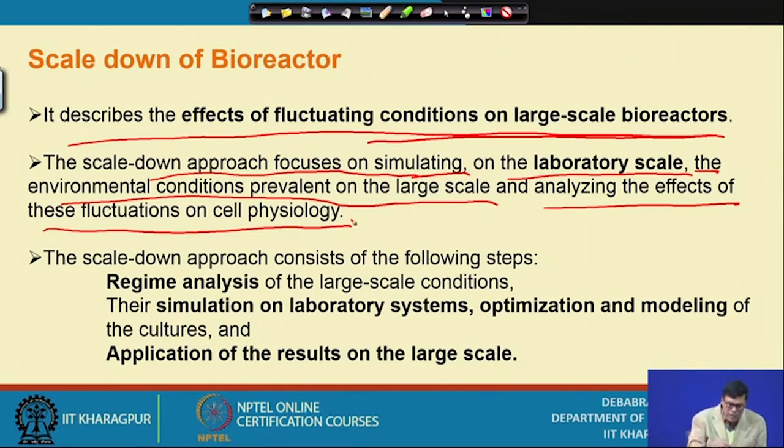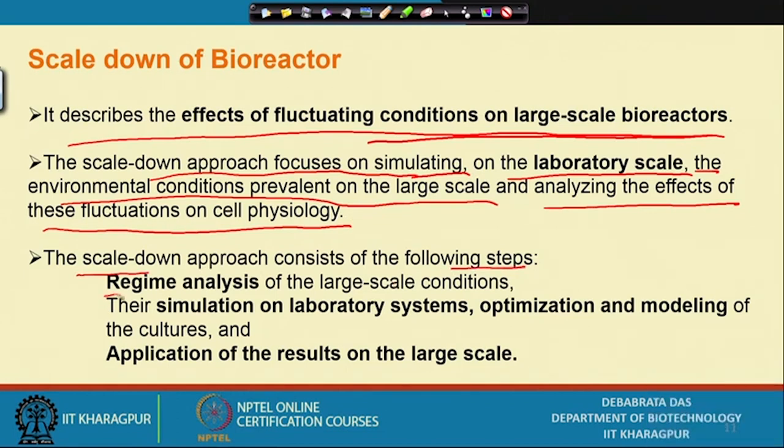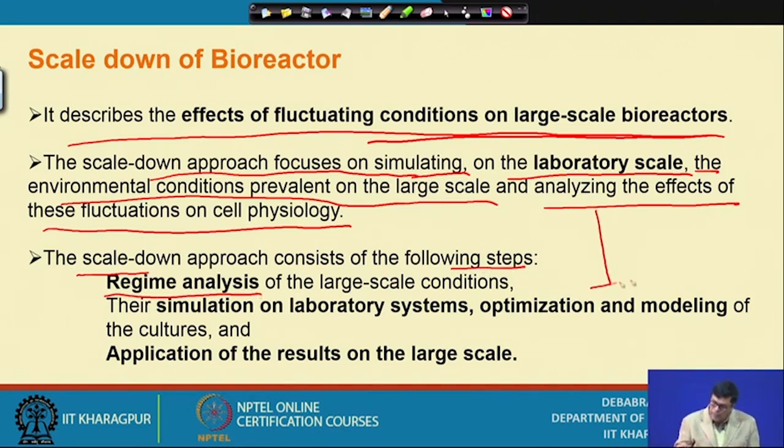Now, scale down operation consists of the following steps. One is the regime analysis. Regime analysis is very important. Regime analysis means, suppose this is the agitation and this is aeration. The regime analysis is something like this.